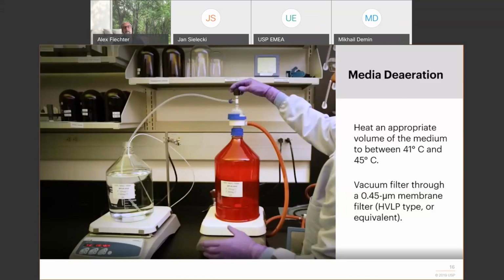So consider the drop of temperature that you have, because you would want to start the test with a degassed medium immediately, so that if it's exposed to environment, the medium will not re-gas or reaerate again. So you would ideally define a temperature at the degassing of this medium that you know when you transfer the medium has exactly, or let's say plus minus 0.1, 0.2 degrees centigrade, so that you can immediately start with the test.